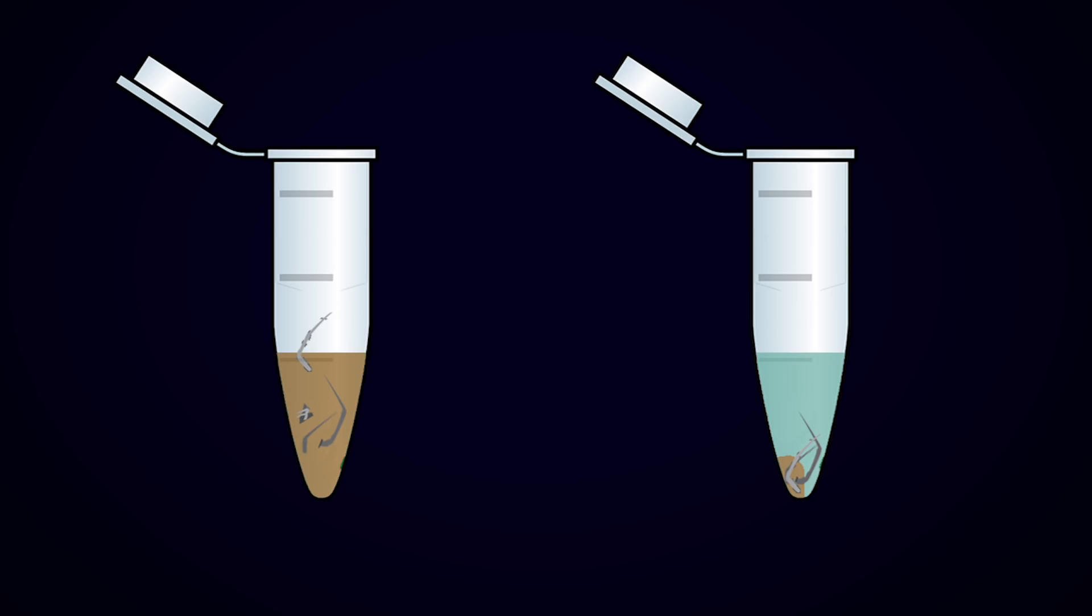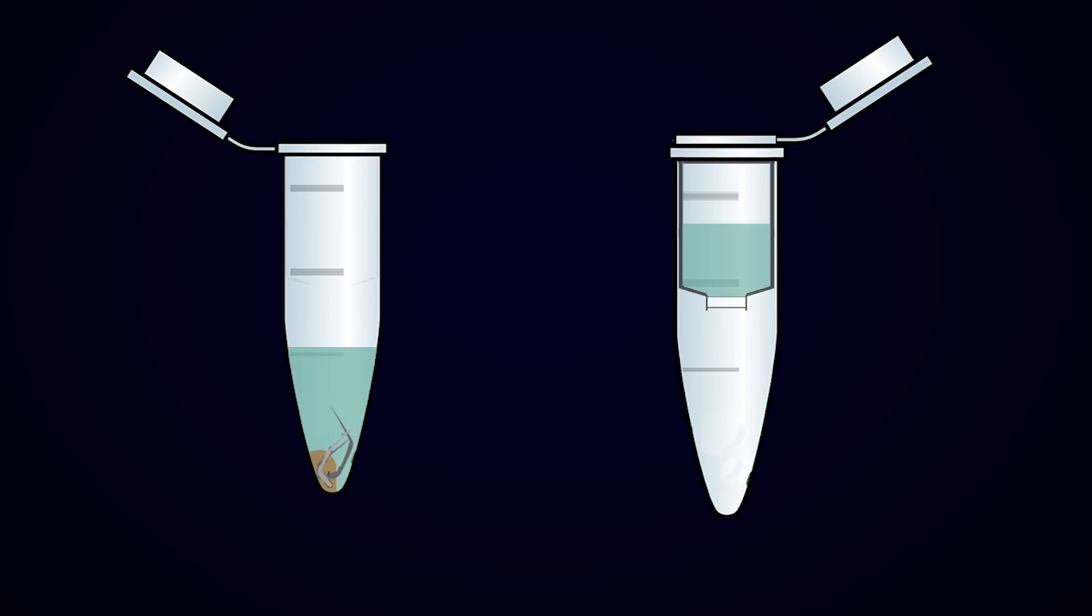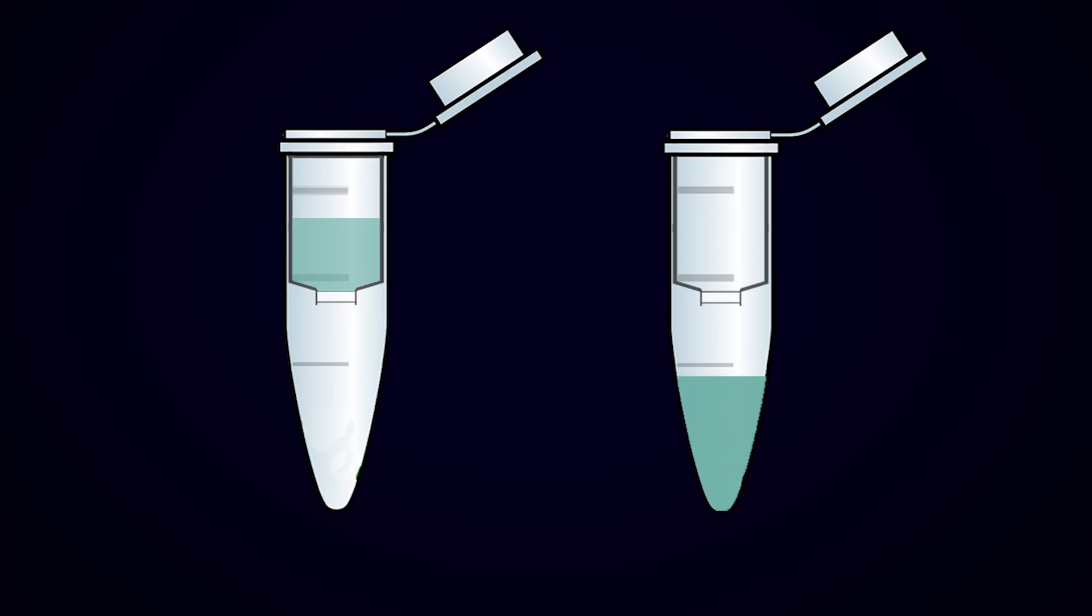This is done using a centrifuge, and all the heavy debris will sink to the bottom. We then take our clean solution and load it into this special tube. It's basically the world's smallest coffee filter, and the filter in this case is either made of silica or a special resin. We load the tube into a larger tube which will act as our collection cup, and then spin it in the centrifuge to pull the liquid through the filter.